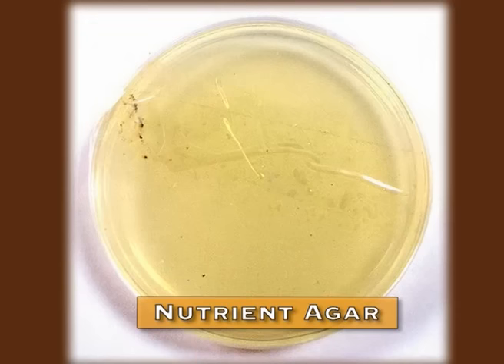Now let us move to the third part of medium under this classification, that is, the semi-synthetic medium. Semi-synthetic medium is generally a mixture of synthetic compounds and complex compounds. For example, the nutrient agar which we use in our lab is generally a mixture of peptone, beef extract and NaCl.